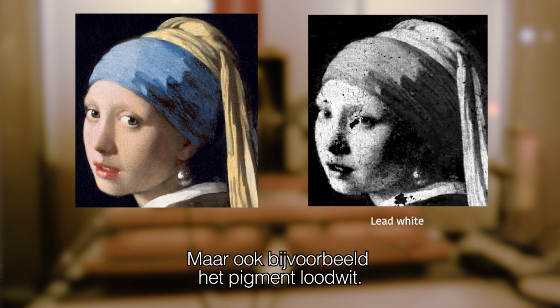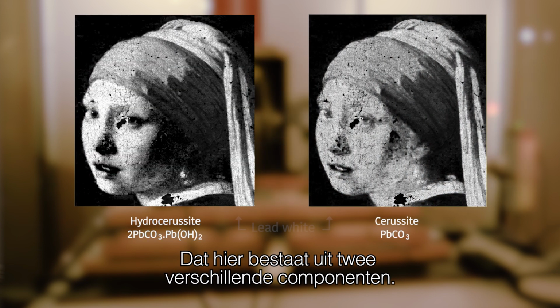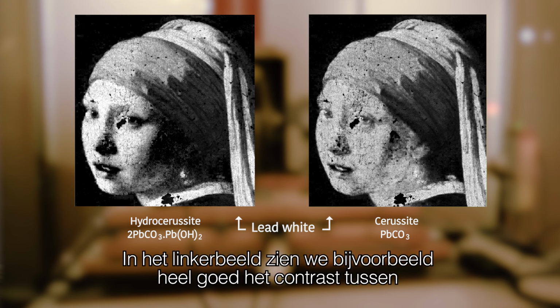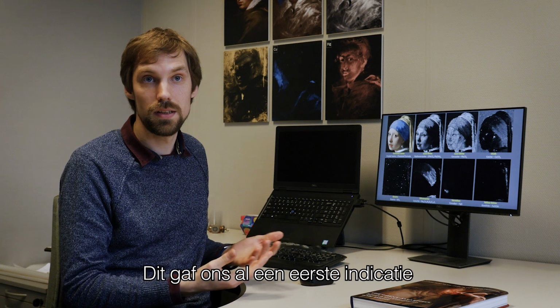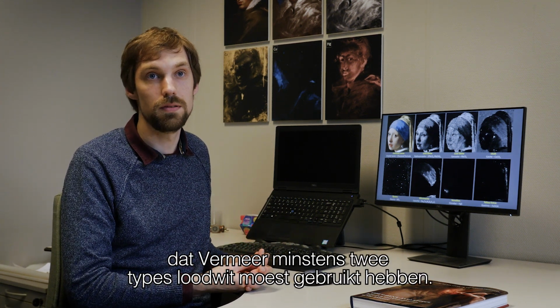And we also have, for example, here the pigment lead white, which consists of 2 specific chemical compounds, hydrocerussite and cerussite. Here on the left side, which shows a very high contrast between the bright areas on the cheek and the darker shadow tones on the cheek. While in the second component, this contrast on the face is much less clear. Now this already gave us a first indication that Vermeer used at least 2 different types of lead white.